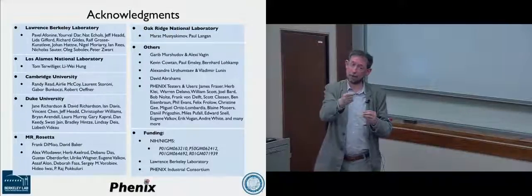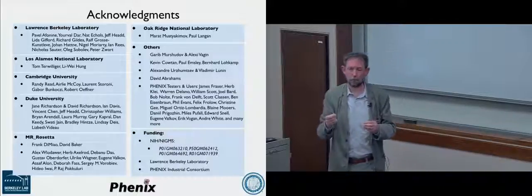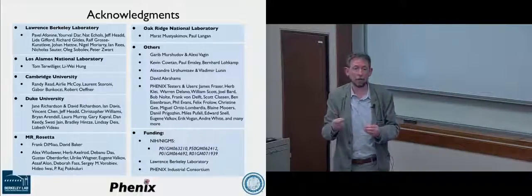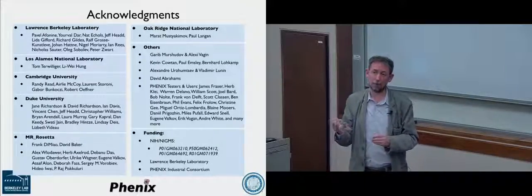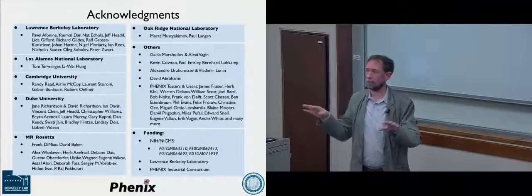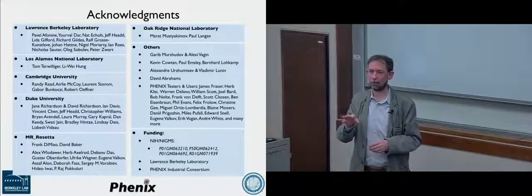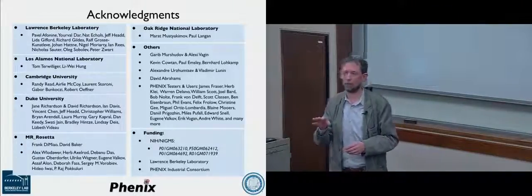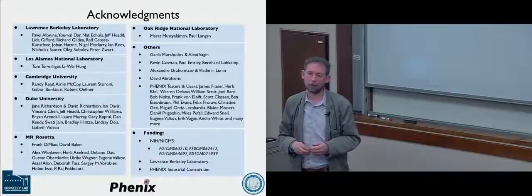Now, people like the JCSG, because the largest structural genomics centers were asked to do this, have been doing this for some time in one form or another. So they've been very good about providing more information, but the general users have not been asked to do that. But it is valuable information, and we think that it should be in there. But if the PDB asked you to do it all by hand, you would revolt, I'm pretty sure, and there would be a riot. So it has to be more automatic. It has to be done by the software, I think.